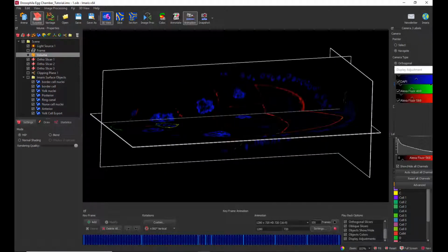Right, so now there is a question, how many frames should I pick? So as I mentioned, as a starting point, just calculate the number of frames by 24. So it's 9 here, so I could do more or less 10, so it could be 240 frames, and this will ensure roughly that the video will last 10 seconds, so it should be enough for all the transitions.